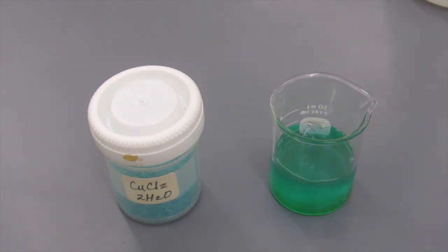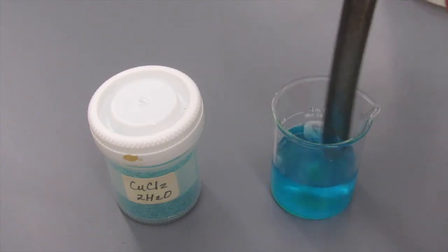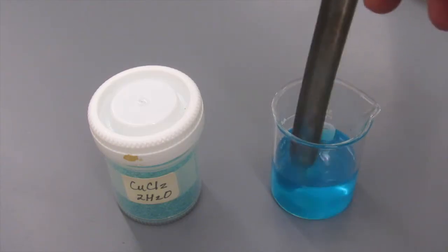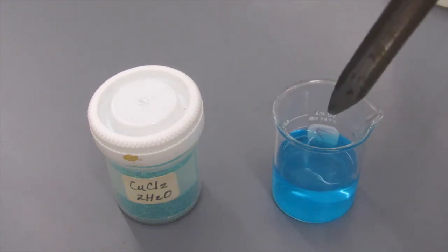It starts off being a greenish color, but as you start to stir it, it'll quickly turn more of a lighter blue or turquoise color. At this point, we're ready to add the aluminum.